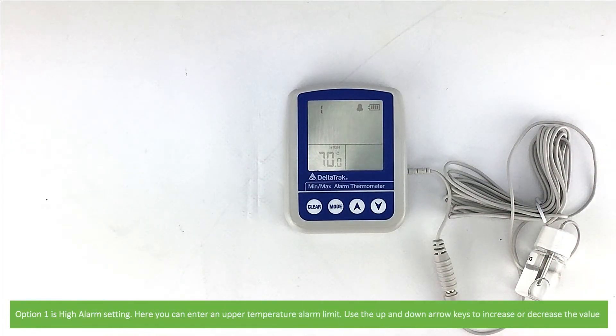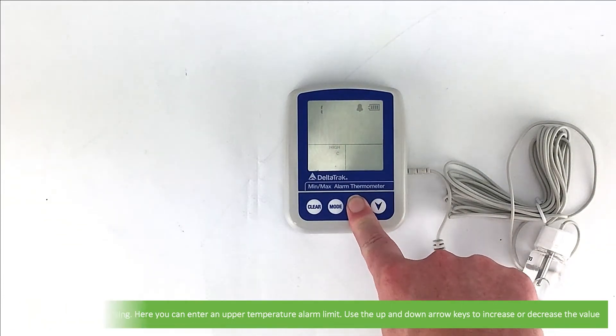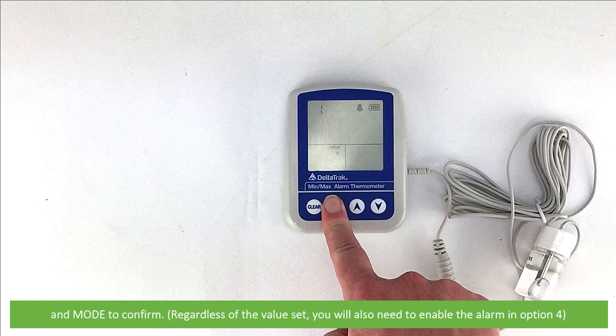Option 1 is the alarm setting. Here you can enter an upper temperature alarm limit. Use the up and down arrows to increase or decrease the value, then press Mode to confirm. Regardless of the value set, you will also need to enable the alarm in Option 4.